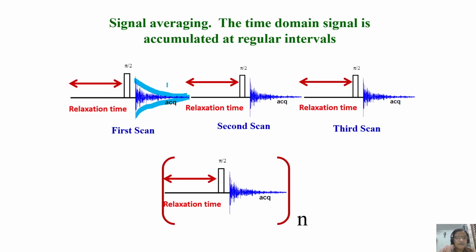The decay in the XY plane is called transverse magnetization. I remember we discussed this in one of the classes before. The decayed magnetization will grow along the z-axis. It is an exponential growth. Decay is also exponential, but the time periods for decay and growth are different.